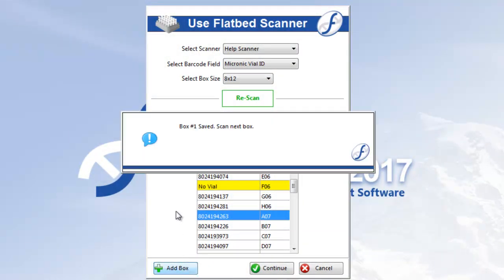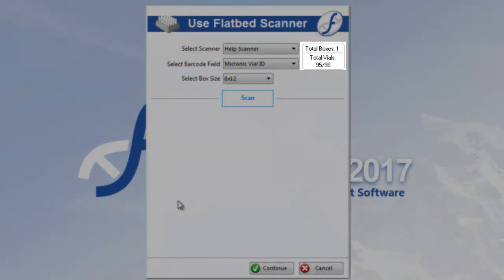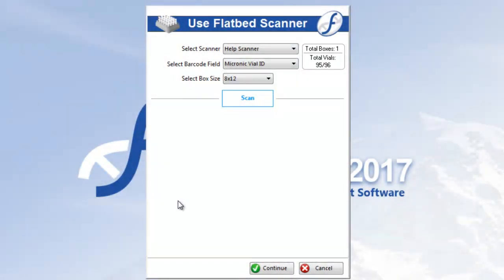When you add a box, a box report appears at the top. Like the scan report, it tells you how many boxes have been scanned and how many total vials have been scanned across those boxes. Now you can scan as many boxes as you like, and when you're done, click Continue.